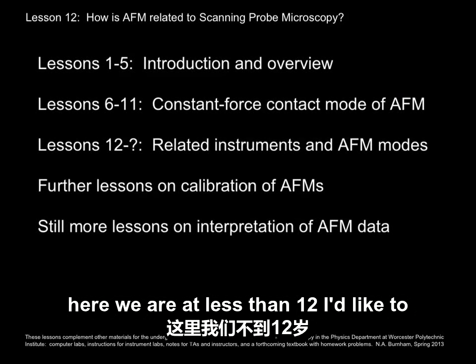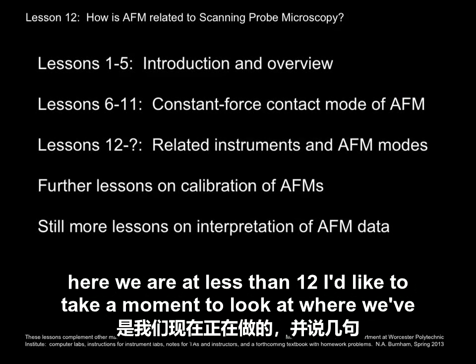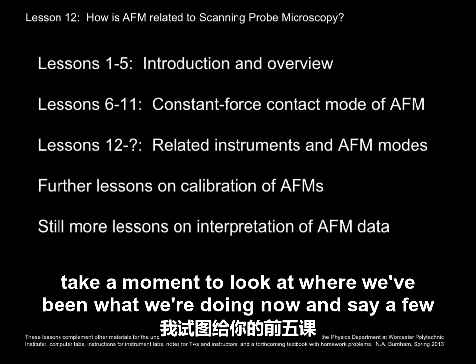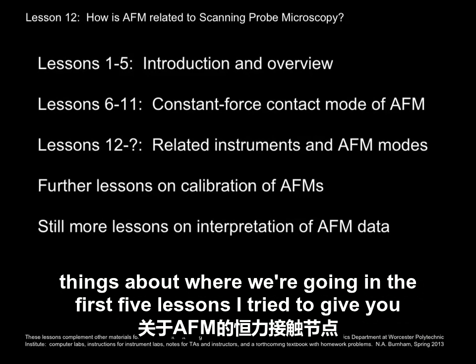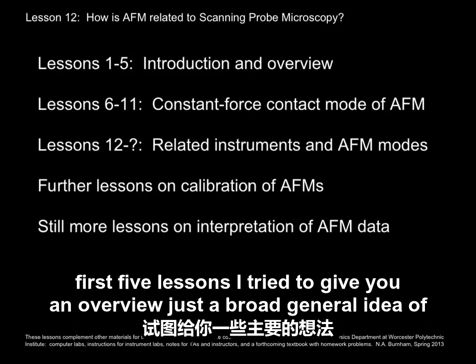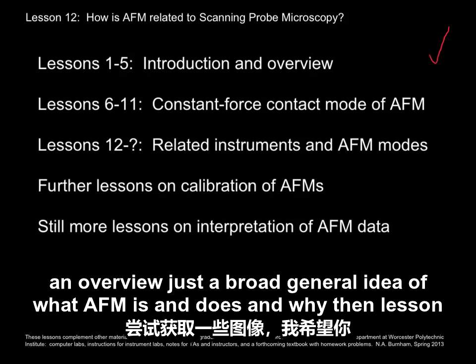We are at lesson 12. I'd like to take a moment to look at where we've been, what we're doing now, and say a few things about where we're going. In the first 5 lessons, I tried to give you an overview, just a broad general idea of what AFM is and does and why.